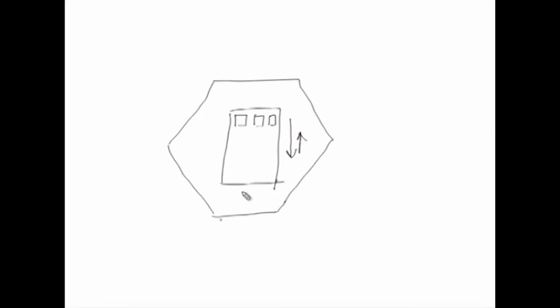Accordingly, these 4 electrodes which are placed in here will change, and they will be either negative electrodes or positive electrodes.